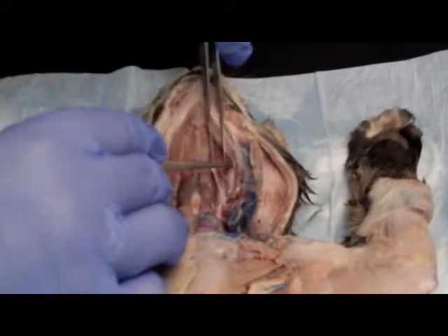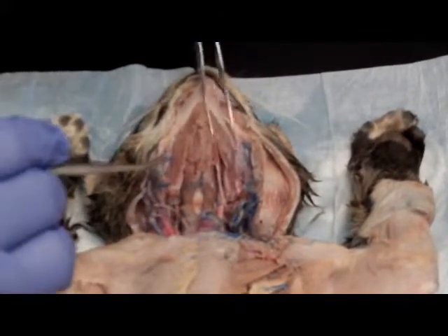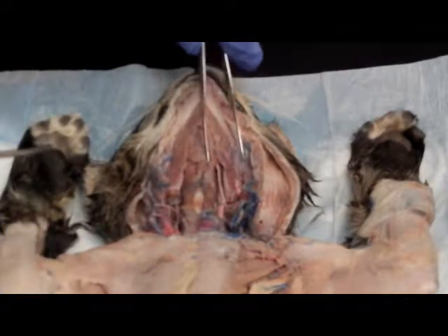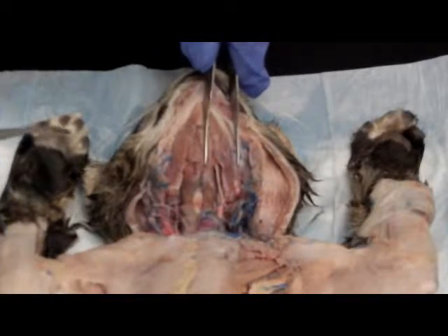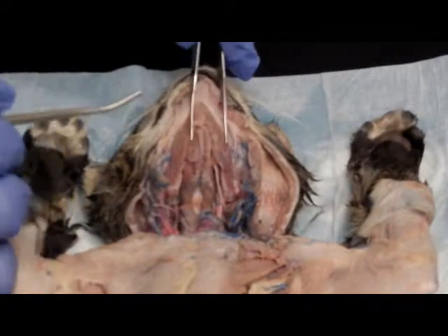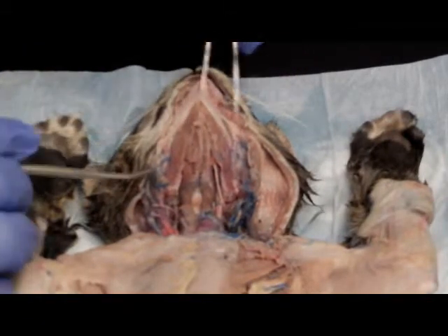What I can gather is in here, this flap right here is the mylohyoid, and its origin is the inner surface of the mandible. The insertion is the median raphe, and its function is to elevate the floor of the mouth by elevating and retracting the hyoid.